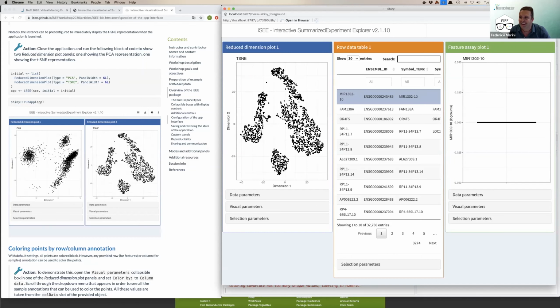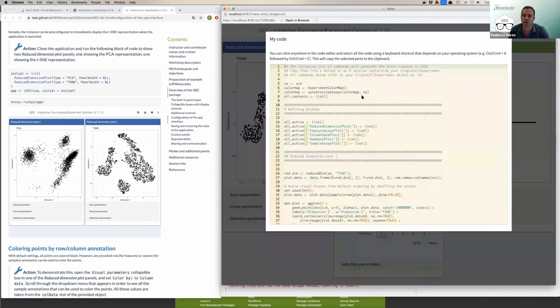Okay. Kevin already gave you a sneak peek of one of the features I like most: whatever you've been generating live, you can click on the extract the R code button, and then you just Control-A, Control-C, and Control-V, put it in your report or script, and then you generate one-to-one all the plots that you have done.